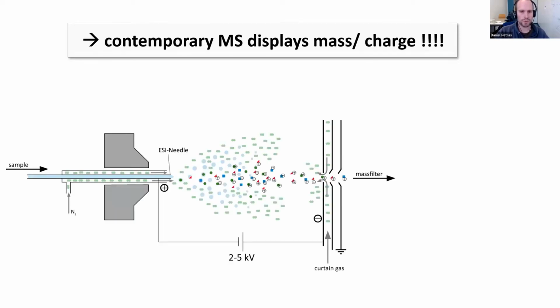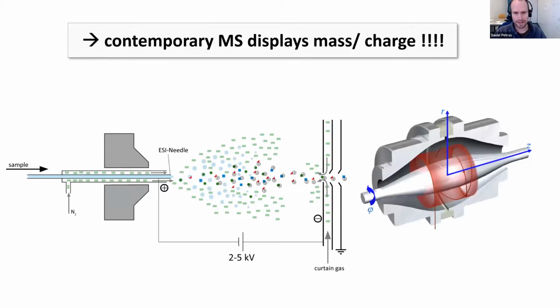Then, in addition to those fundamentals, we presented ionization methods, such as ESI, and different mass analyzers, such as the Orbitrap. And that combination of the two, ESI and a mass analyzer, is already the perfect setup to couple to liquid chromatography, because that's what is most often used. ESI, electrospray ionization, is a very well-suited interface to couple like this.